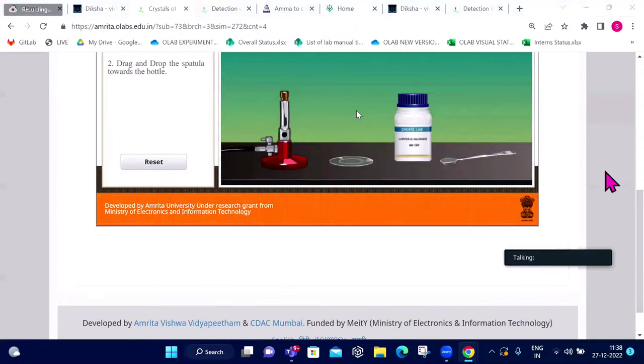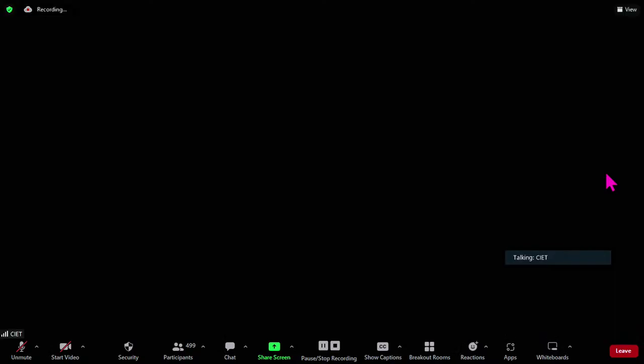Thank you very much, Ms. Anukha, for this quick and easy experiment. As you can see, the substance changed color. So, Dr. Yashpal, is it a kind of magic for the students? Definitely, chemistry is always magic. You can see the structure of the chemical formula. If we do heating or something, that definitely is going to change, and it's the magic.